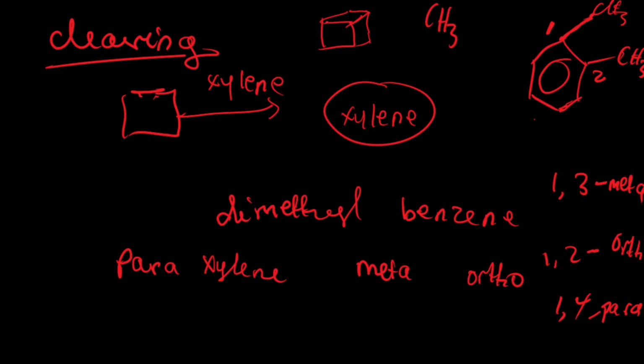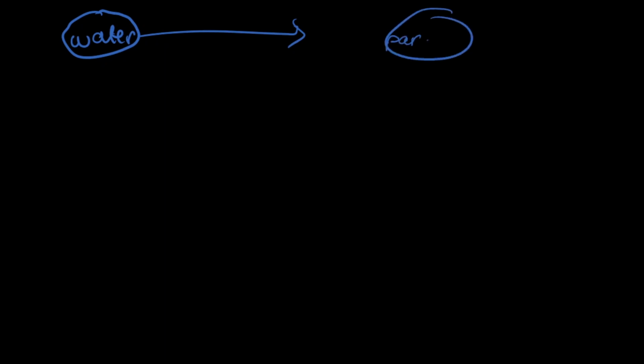The next step is the embedding. Okay, it's the last step of the paraffin embedding. So the goal of the paraffin embedding is to replace all the water in this tissue block with paraffin. Okay, however, as I said earlier, this process cannot take place directly. It needs to take place in steps because paraffin is insoluble in water.